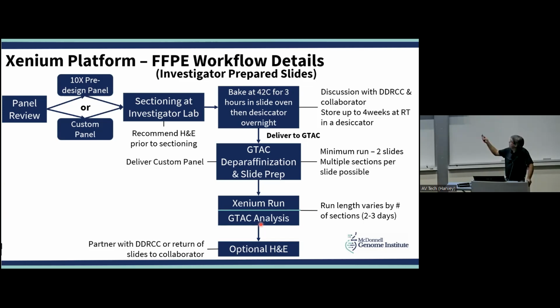And then at that point, it's relatively similar to the prior process. But again, really stressing, if you've got a lot of experience doing this, if you have people with good experience doing this, if you're comfortable doing this with us, that's great. If not, I really do recommend working with the DDRCC to get your sections and make the slides.